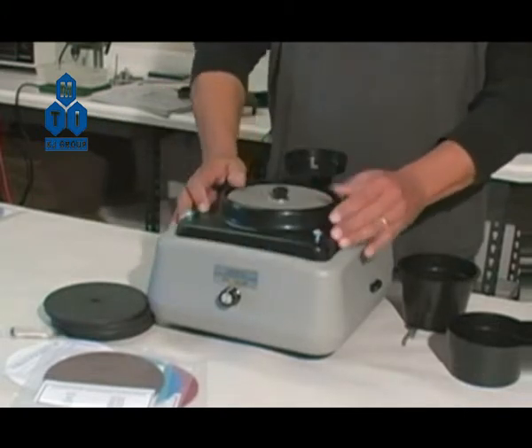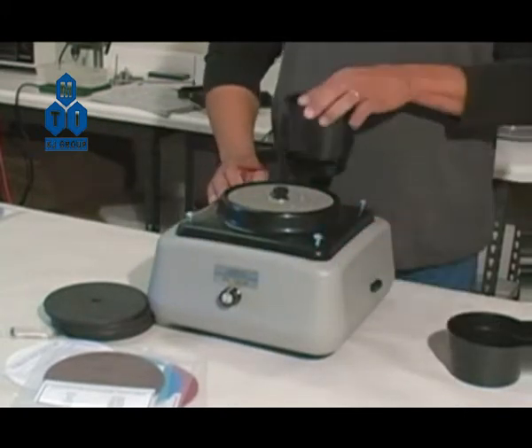Align and place the water guard over the top of the disc. Attach the coolant reservoir to the top.